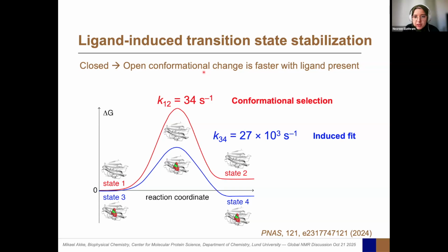Have you done a square calculation using T1, T2, NOE experiments in increasing ligand concentration? No, we haven't, but we have the data for the lactose bound, fully saturated, and the apo state. And we fully expect that any intermediate concentration is just a population weighted average between those. So I think it would be not so meaningful, perhaps. We published a lot of data on this. That's a whole separate story.